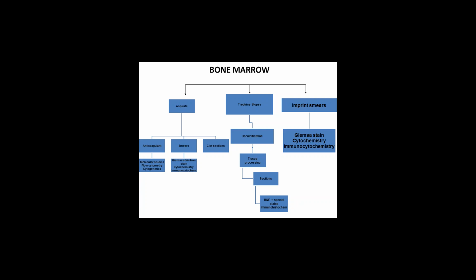Now these smears are generally stained with a good quality stain, whatever you prefer. I generally would suggest that for bone marrows one should use Giemsa stain, a modification of Giemsa, that is the MGG, that is generally used for our cytology slides, because they give better results. The granulation in the bone marrow aspirate and the nuclear details are more clearly visible when we use either an MGG or a Jenner Giemsa or a Wright Giemsa, whatever you can make for yourself.